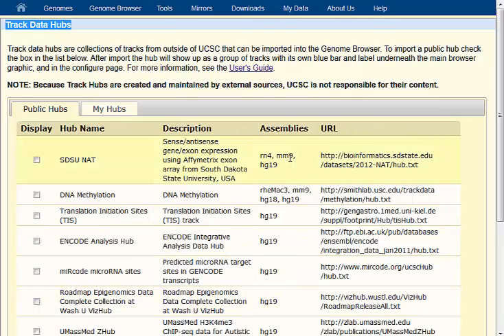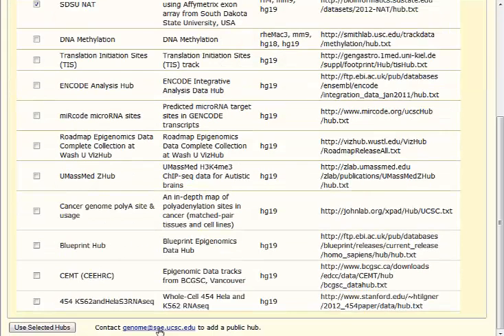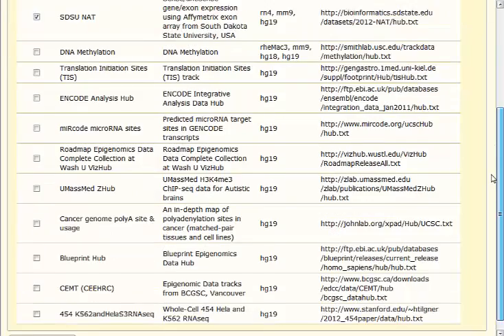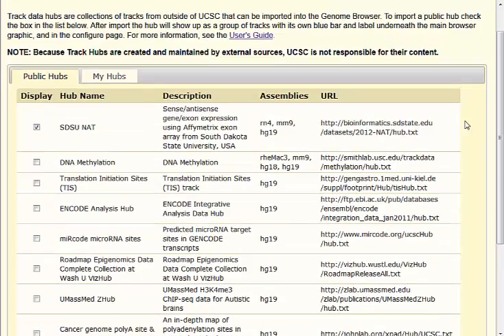It varies here — you can see rat, mouse, human. You can click the checkbox here, click the use selected hubs, and the data available from the server will be loaded onto the UCSC Genome Browser for you to explore. You can see a lot of research groups have tried this already, and they've created public hubs that are available for everyone to use.